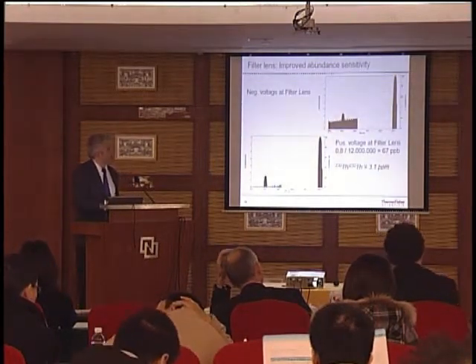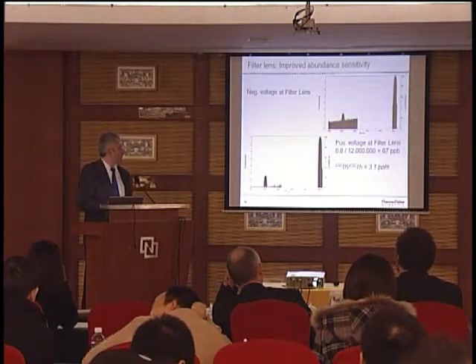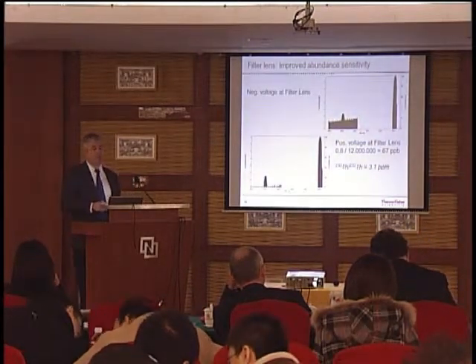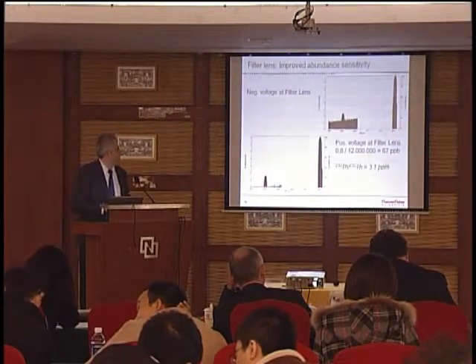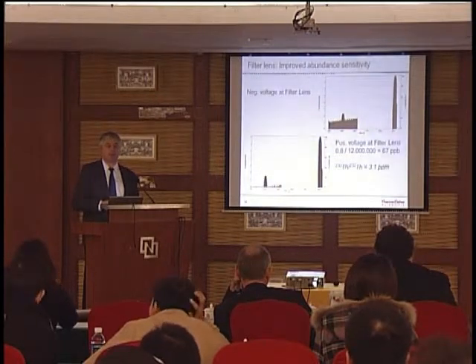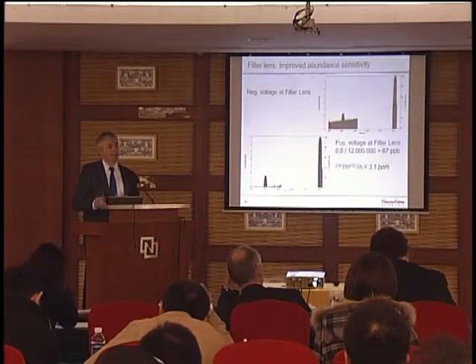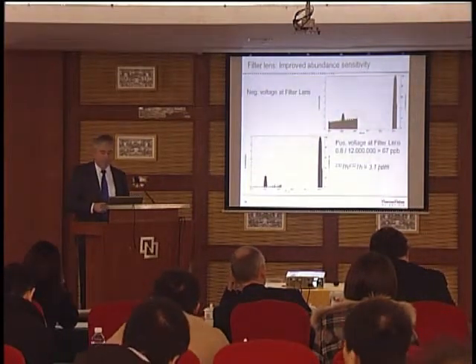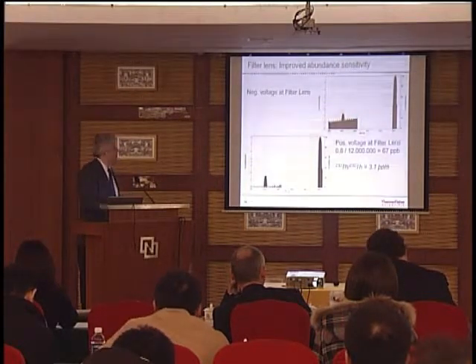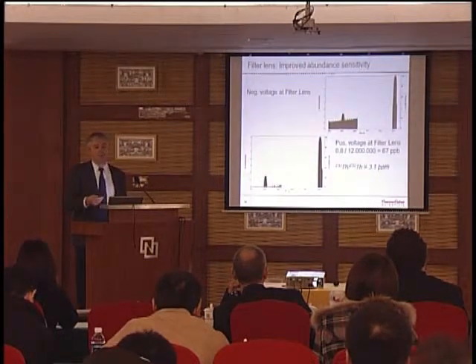So this means we have a contribution from the 232 peak to the 230 peak of 0.8 counts per second, and compared to the sensitivity of the 232 peak of 12 million counts per second, we get an abundance sensitivity of 67 ppb, which is also for a sector field instrument very good performance. Looking at the ratio determined here, we got 3.1 ppm, and as I said, the standard is 3.11 ppm, so a very nice result.